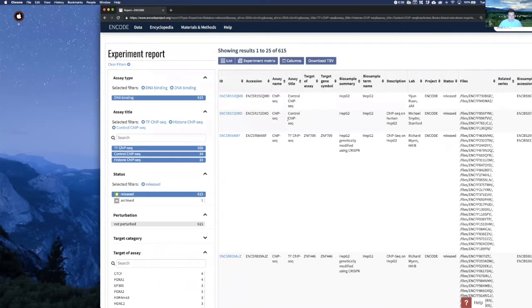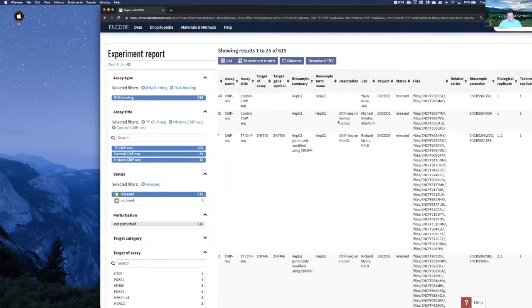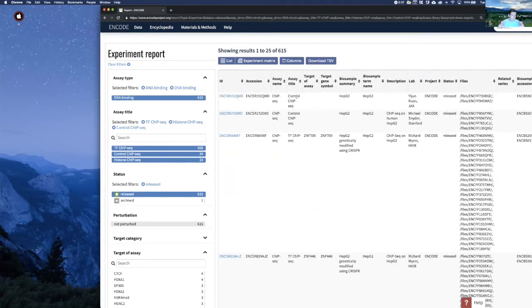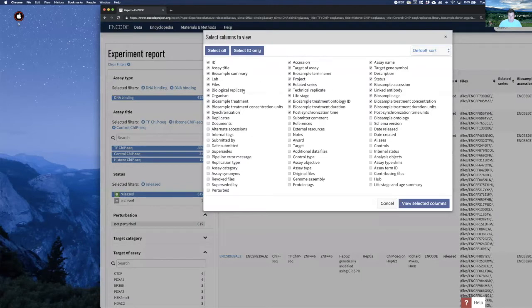So we're really in the basic first steps of designing an experiment. We're saying, give us all the data that meets these requirements. So this is great. It tells us the files, and this is a bunch of metadata, if you will. And that's really what an API does, is it says, here's all the things you might want. So now let's look at the columns here. Okay, it's got everything we wanted. We want what the ID is, replicates, and making sure that controls is clicked is important.